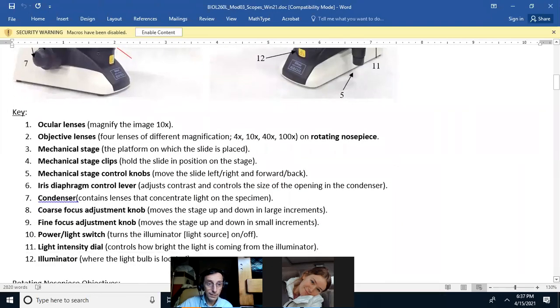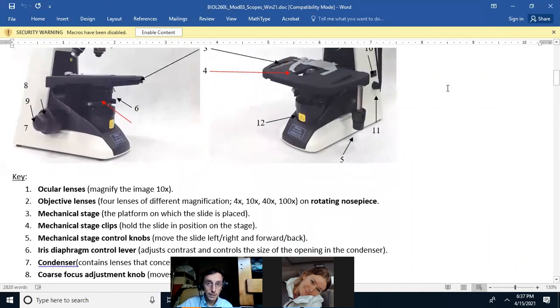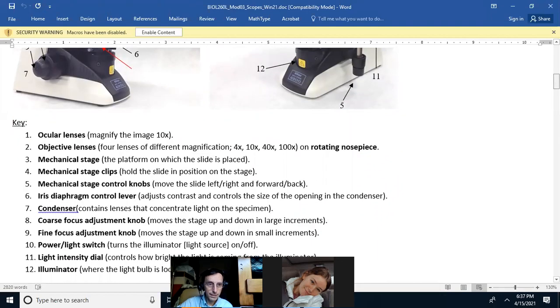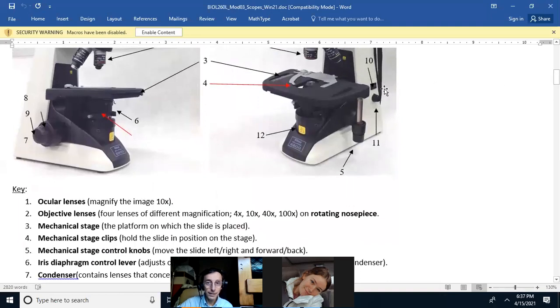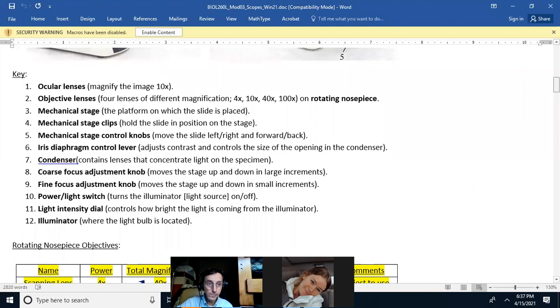The light switch is the power button. The rheostat — they call it the light intensity dial, but I'll call it the rheostat — controls how much light is coming through the lamp. And the illuminator is the light, the lamp itself.